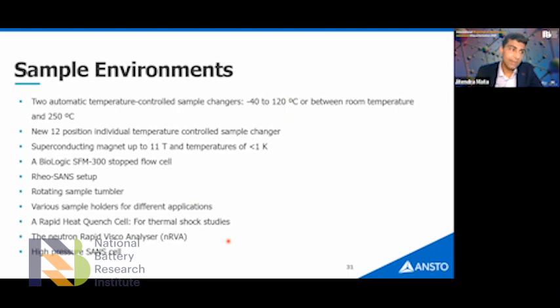One of the experiments I did was where the researcher wanted to study how they can apply pressure for recycling plastic. This is a plastic with two segments, and we wanted to see if we can apply pressure and mix these two segments within each other. This is a very cool experiment. The data are not published yet, but will soon be published.